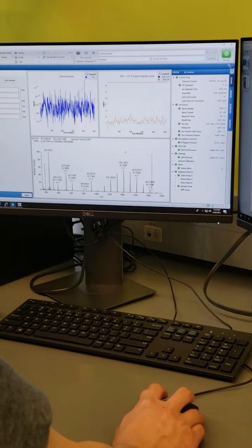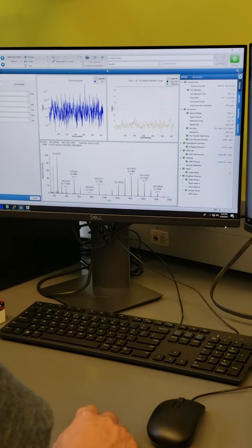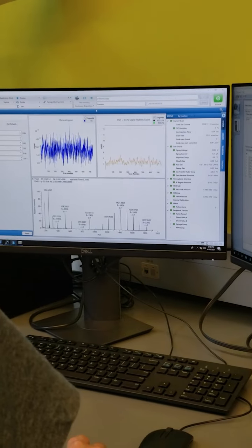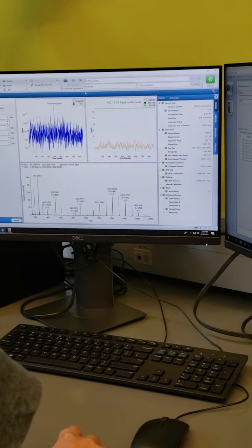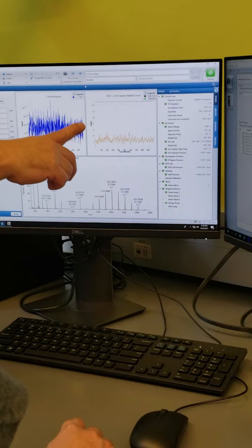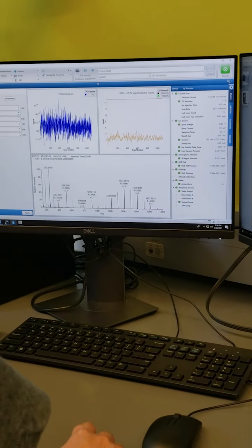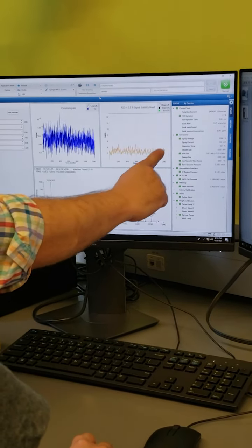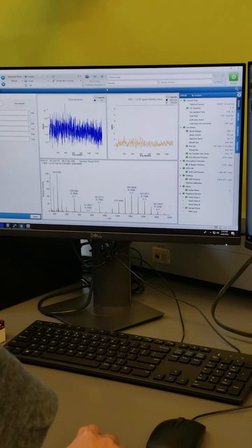But I usually like to wait about 100 scans, and I already know it looks good. But if there was something going on with the source, and you needed to manipulate the position or change your spray settings to make sure that your stability was good, this is where you can make manipulations on the fly and watch this. So for your purposes now, everything looks really good. You want this value to be below 15%. And you're there at like 2%. Actually, the bottom end is right below you. So your spray stability is rock solid.